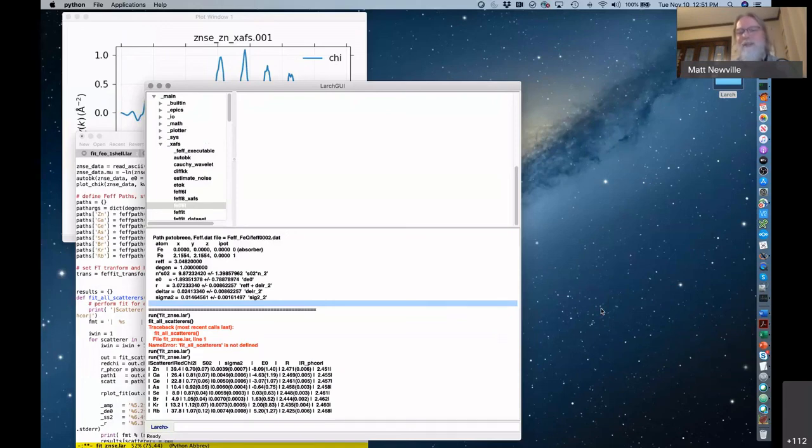So long ago when Bruce and I were students together, he wrote an awesome package for doing FEF fitting, all of this stuff that I just did in a text file as an Emacs like mode, which is crazy, but it was awesome and it worked better than anything since. Okay, so that's just to say I don't know that, but I have been thinking about running through these examples and actually doing more data fits to more model compounds and running more FEF calculations.